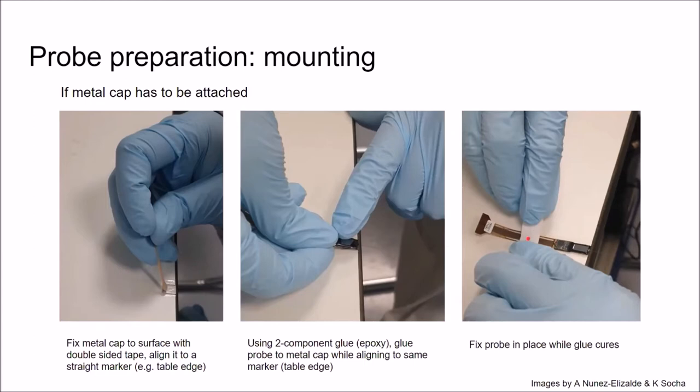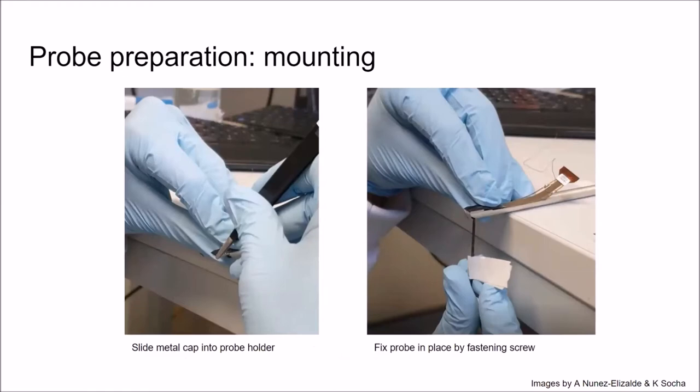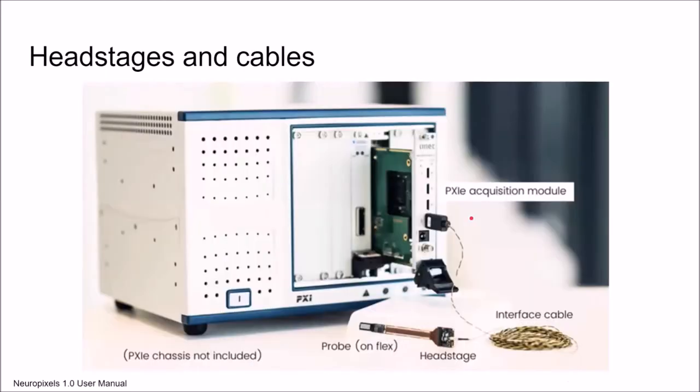You align it and then you fix the probe to the table, for example with some tape, so that the glue can cure for a while and makes a perfect connection to the metal cap. Once the metal cap is glued to the probe, you can then slide the whole probe to the rod, which will be held later on by the manipulator. You need to be careful with this again. You can use forceps to move the probe into this holder. Once it is in place, you can just tighten or fasten the screw. Now we have the probe fixed to the rod that will be held by the manipulator.